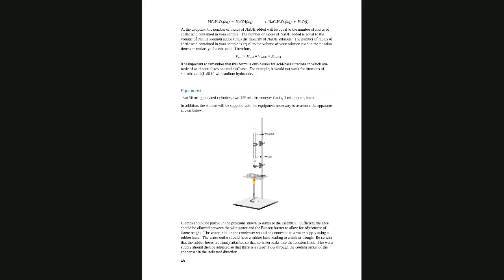Before we continue, I wanted to show you how we are going to do a titration. We said 3 titrations. Let's explore a little bit about the titration. What is happening in the titration? This is acetic acid that reacts with sodium hydroxide.